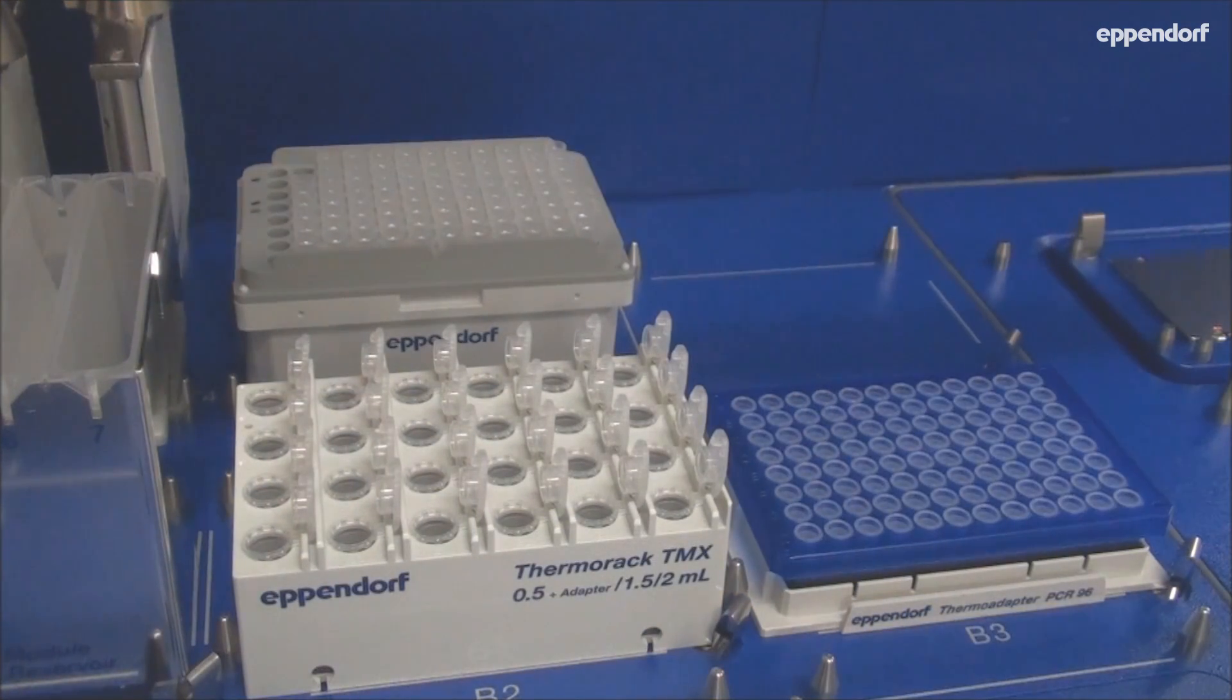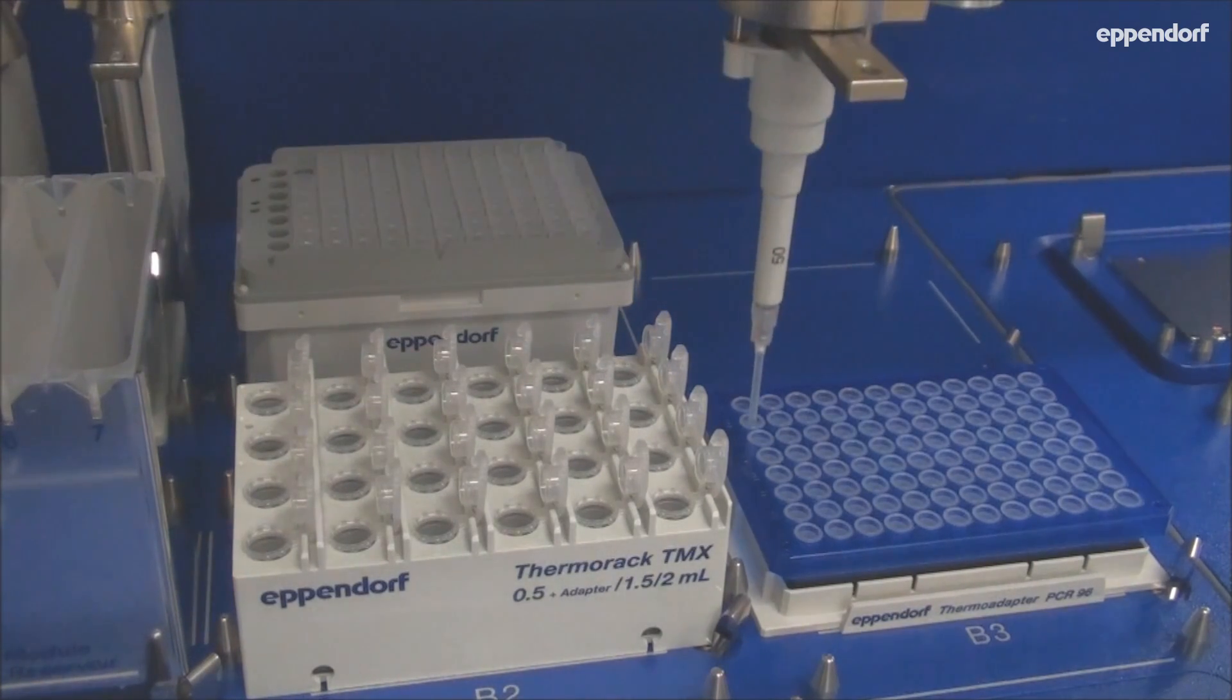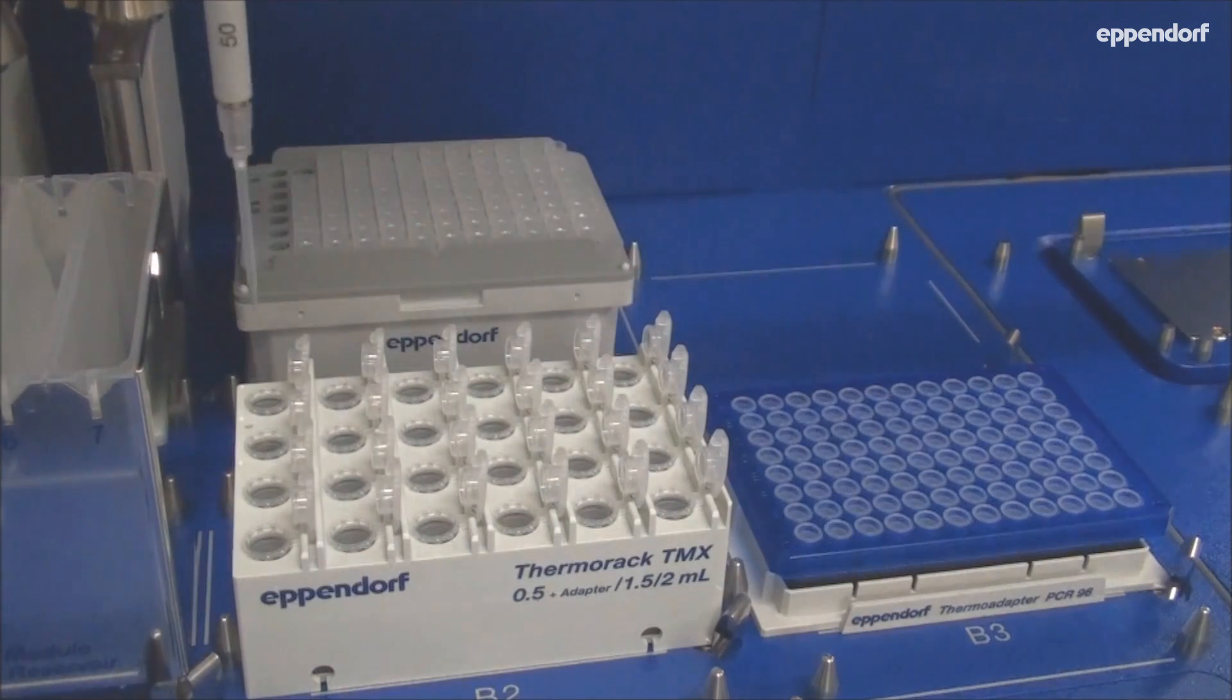During adapter ligation, the user can choose how they would like to pair their indexes or tags with samples, followed by a final amplification to ready the libraries for sequencing.